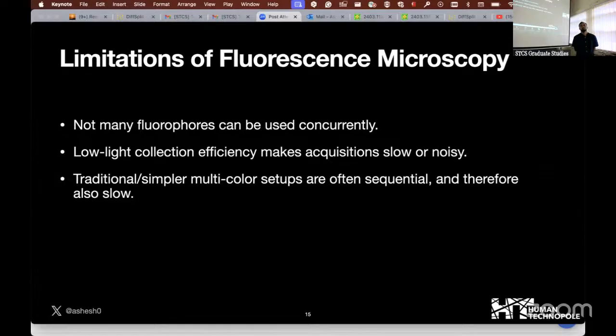It would be, but the problem is that with a single fluorophore itself, the cells are almost burning in the sense that they don't like too much light. And if what you're saying is that I will bombard it from 10 different ways, you could do it, and I'm sure people would have tried it, but due to the reasons that I just mentioned, it is not used. Okay. Yeah.